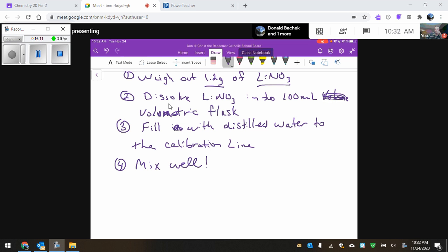You first of all want to dissolve it, and the reason is because we're going to start with some solid, and in order to make sure that solid gets into that flask, I'm going to show you one of the issues, not an issue, but something we have to be aware of. Those neck openings you have to put that into are pretty tiny. So we'll have to use a funnel.